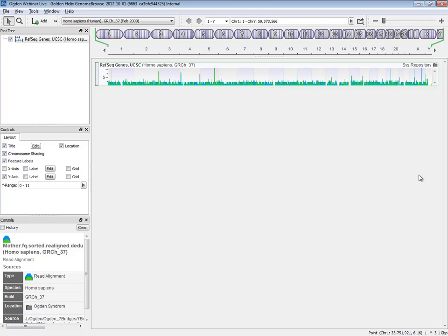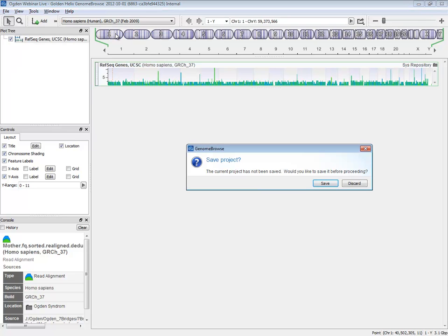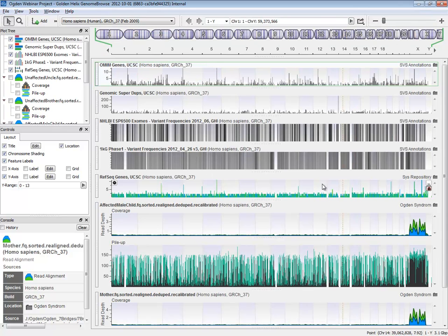validation. Because I'm running all the way up to the end of the hour, instead of jumping into creating this project from scratch, I'm going to open up the project that has all of the files. I'm going to not save my project here. All of the annotations I would like to explore are here. This has the OMIM genes track, a list of segmental duplications. Those are common areas to keep an eye out for, like I said, when you're looking at variants that potentially don't validate.